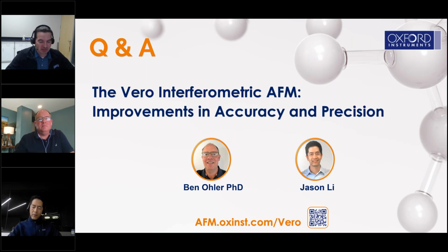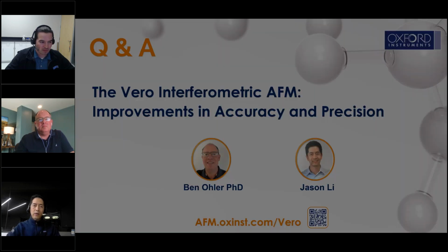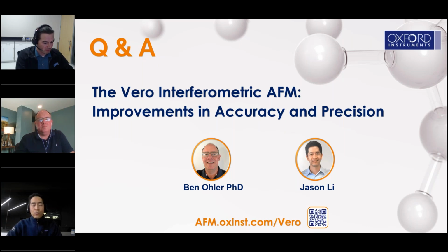Yeah, with PFM, a lot of the measurements that you see in this webinar were taken with an Adama probe. Those were Adama 2.8 probes, and I like them. They're a little bit more pricey than standard cantilevers, but they last a lot longer. They're quite robust, so I end up just reusing the same probe over and over again until the probe tip breaks or it's contaminated. Those are quite nice for robust measurements.